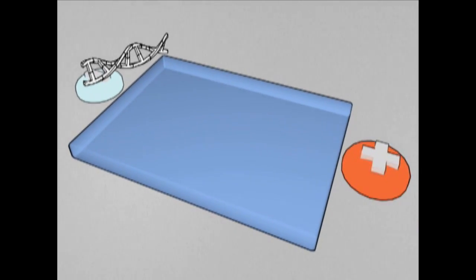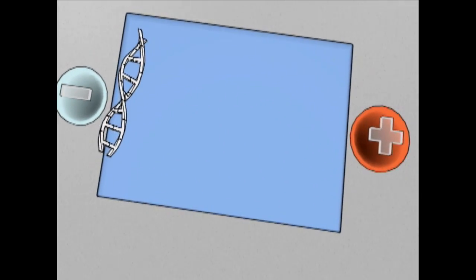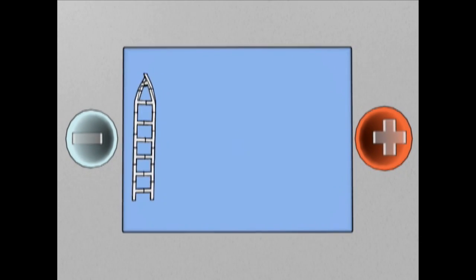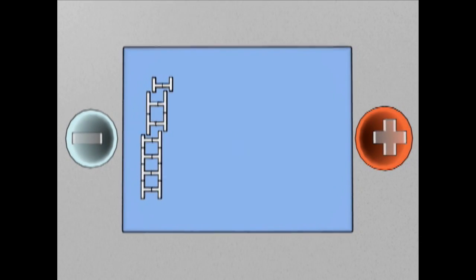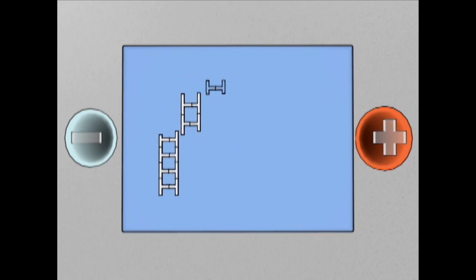DNA molecules have a strong negative charge, so if an electric field is applied to the tray, they will move towards the positive electrode. Agarose gels have microscopic pores, which act as a filter when molecules attempt to move through them. Smaller molecules will move through the gel more quickly than larger molecules.